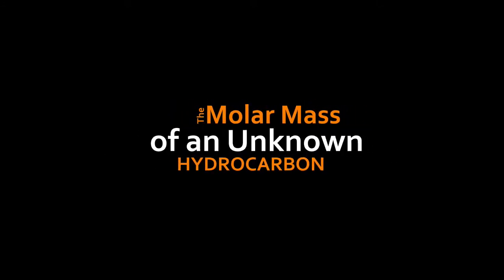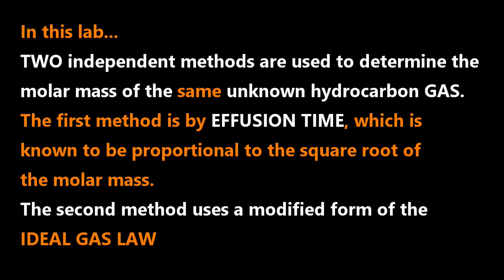As you can see, the title of this lab is the molar mass of an unknown hydrocarbon. And in this lab, we'll use two independent methods to determine the molar mass of the same unknown hydrocarbon gas. The first will make use of effusion, and the second will make use of the ideal gas law.